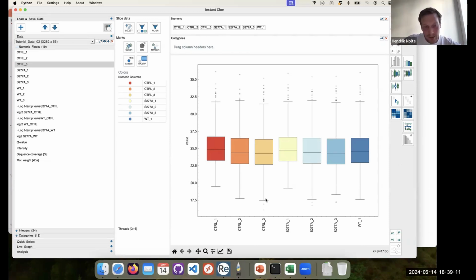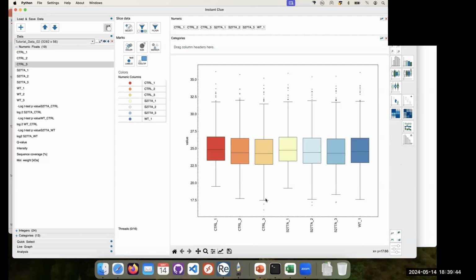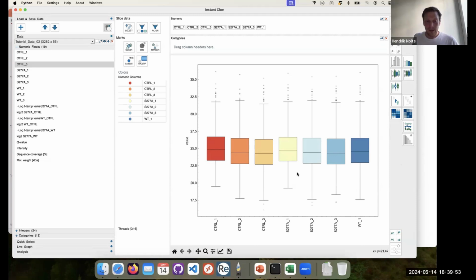So often the reason behind that is that there are fewer proteins quantified in this sample, and if this is too extensive, then you should probably exclude it or try to normalize it by other means, because then this algorithm, which is called label-free quantification, I think this is a bit too much detail now, is not suitable anymore, and it will not be able to deal with this data if the number of proteins is significantly lower in one of these samples. Yeah. But okay, in this example that you give here, everything seems equal, so you would consider everything.